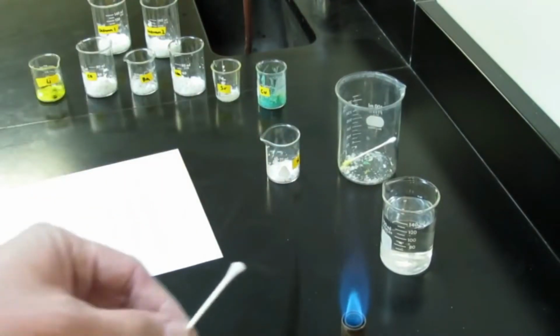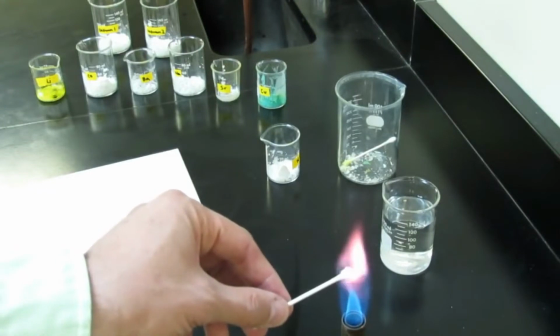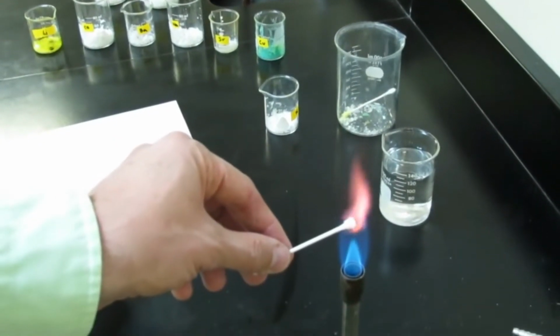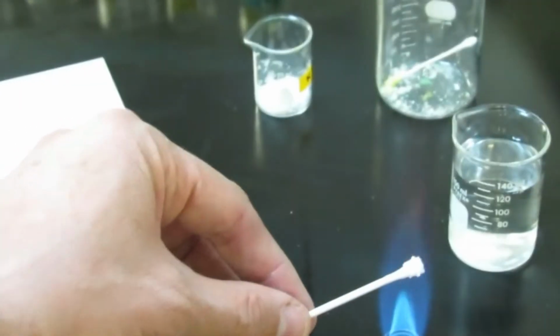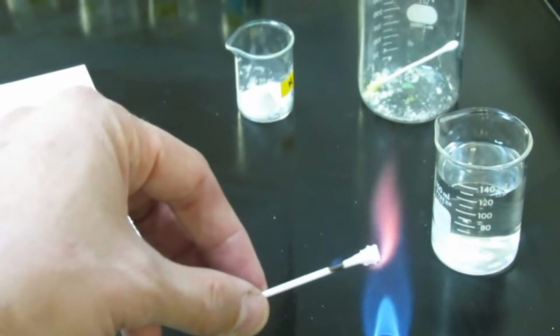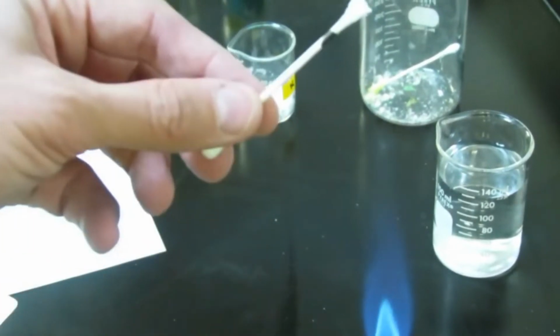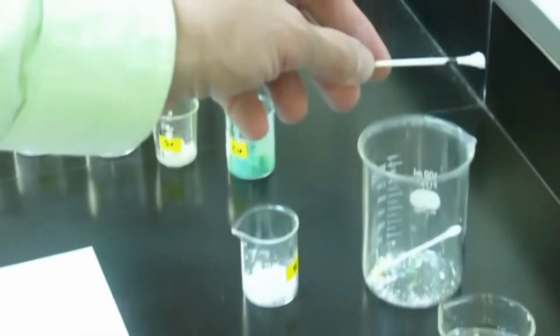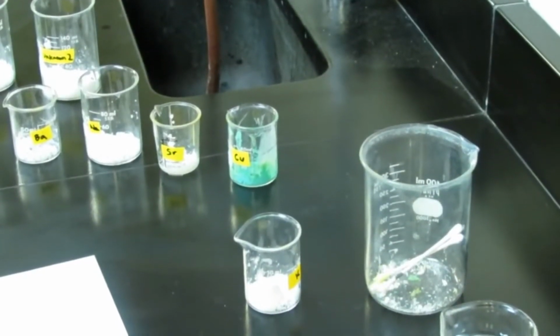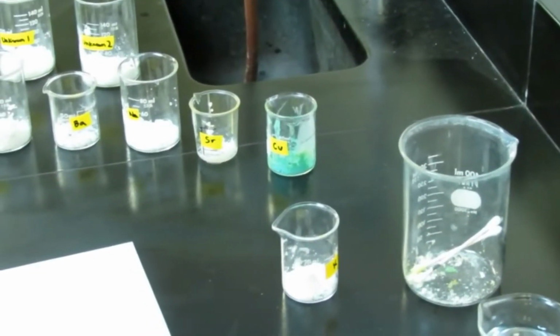We'll then put that in the flame, and we will examine the color there, and we'll record that in our data table. Now please don't ask me, Mr. Hermer, what color is that flame? That's for you and your partner to decide. Now when you're finished, go ahead and take that cotton swab and just place it right in the waste beaker. You don't want to use that again. You're going to get a clean cotton swab for each test.